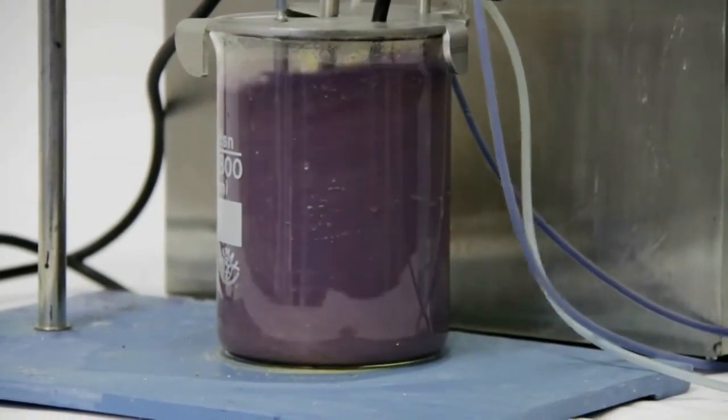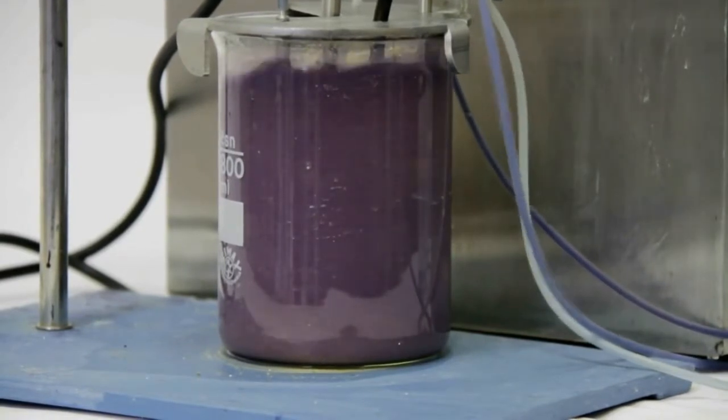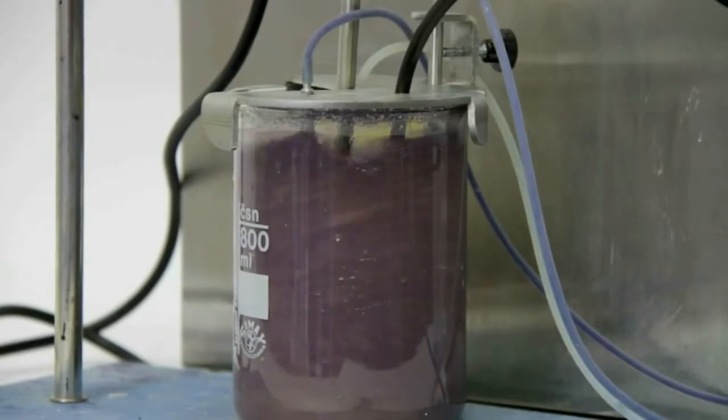Stirring is automatically initiated for the absorption of the mixture. Blue dye and flocculants are injected into the mixture of water and aggregate.